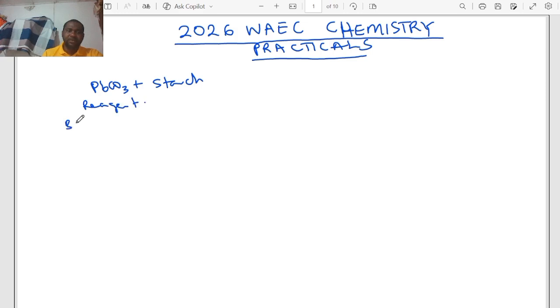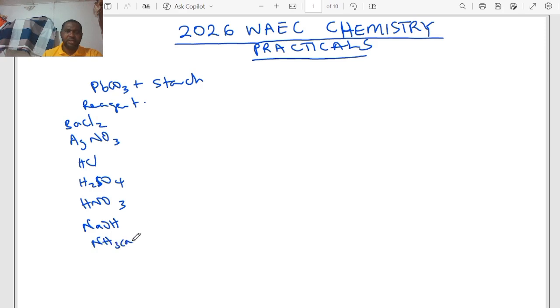You are also given dilute sodium hydroxide, aqueous ammonia, NH3(aq), and potassium iodide.